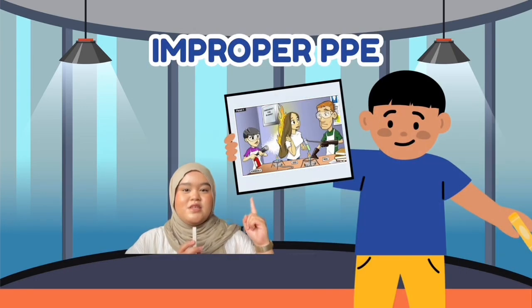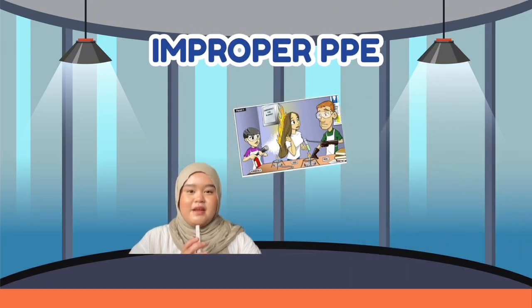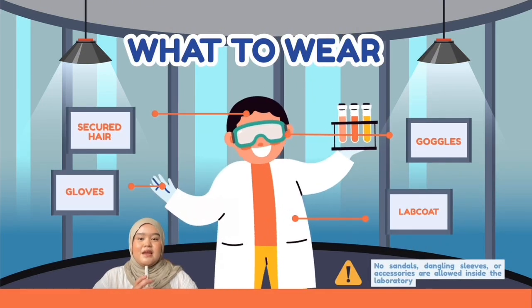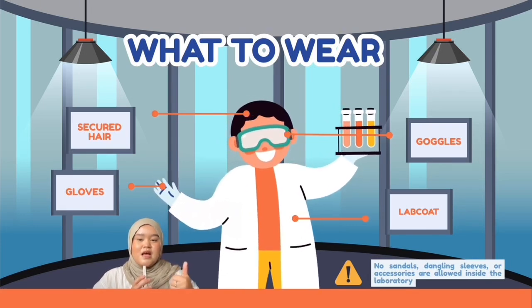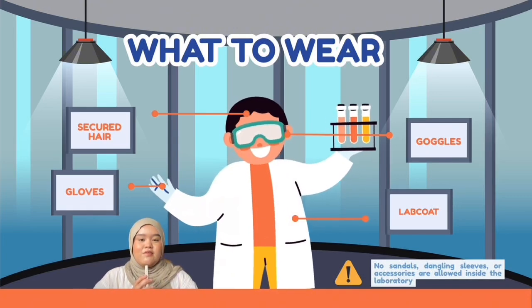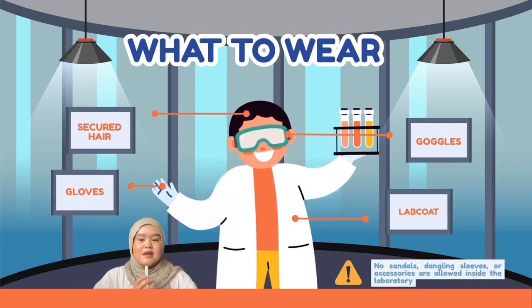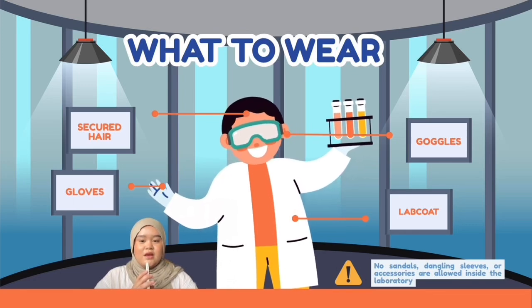This visual shows an example of improper personal protective equipment, or PPE, usage in the laboratory. In this situation, the lab user is not wearing complete PPE such as safety goggles, gloves, or a lab coat. This increases the risk of chemical splashes to the eyes, skin exposure, and contamination of personal clothing.